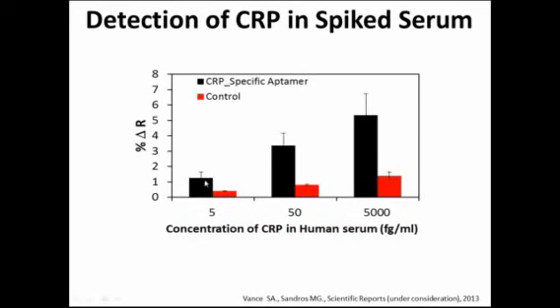The limit of detection was validated to be 5 femtograms per ml. This is in agreement with the limit of detection having a 3-fold higher response than the control, when taken into consideration along with the standard error.